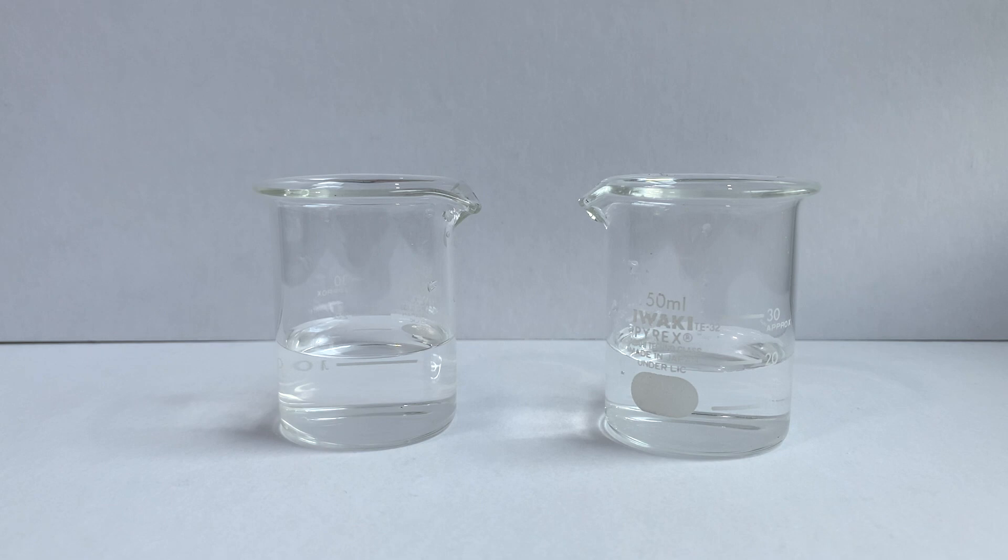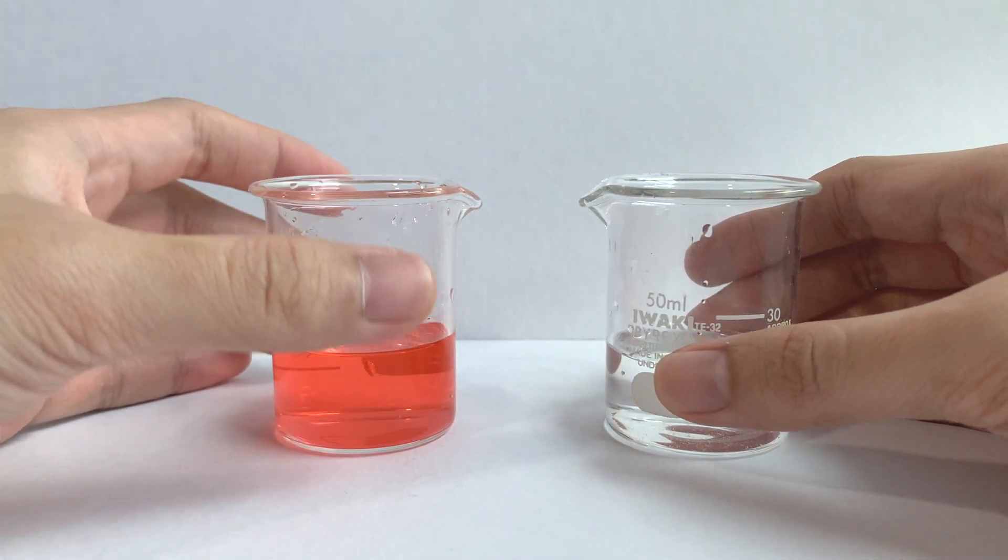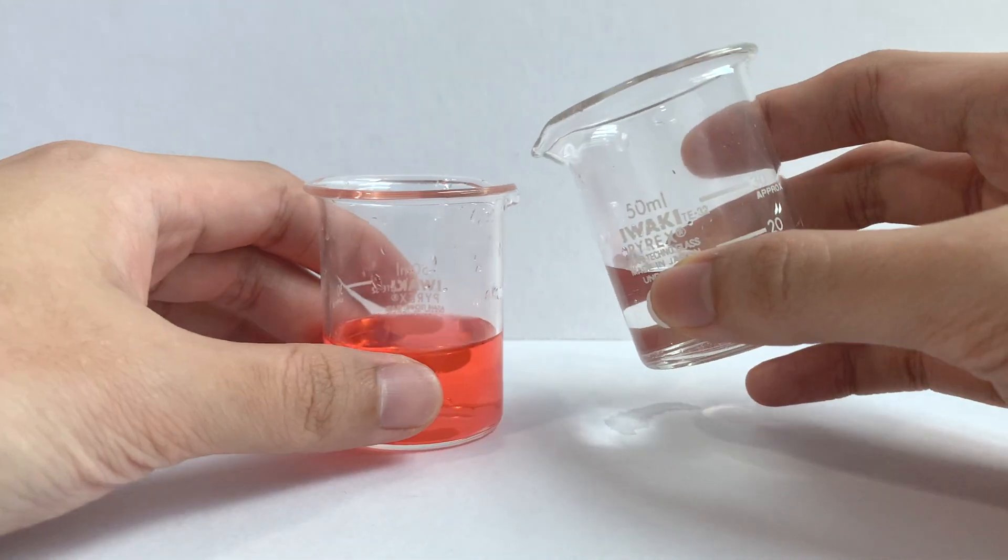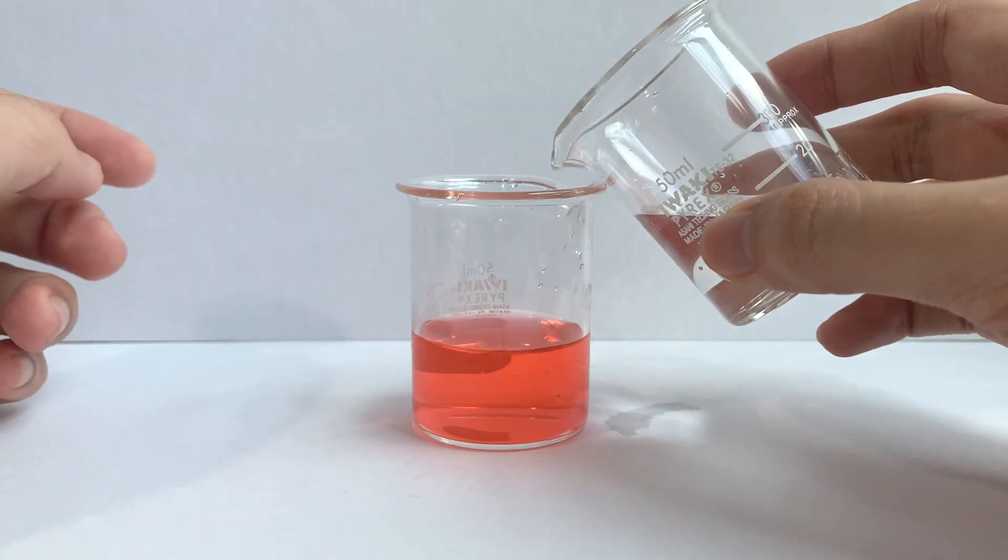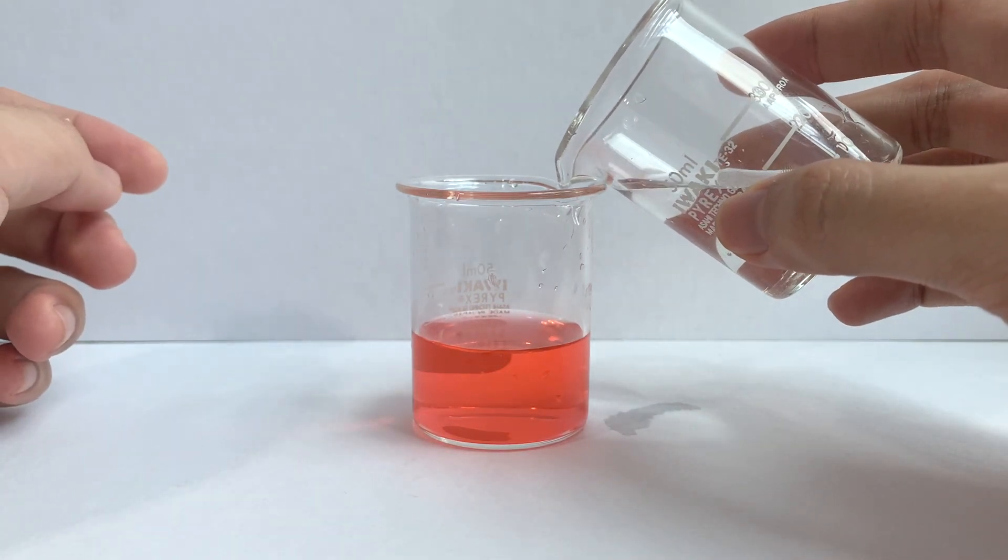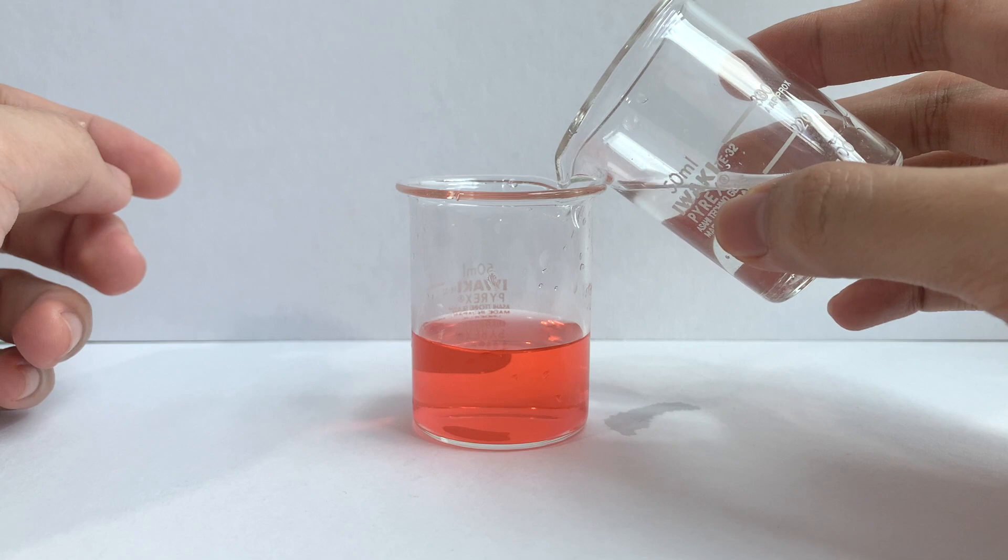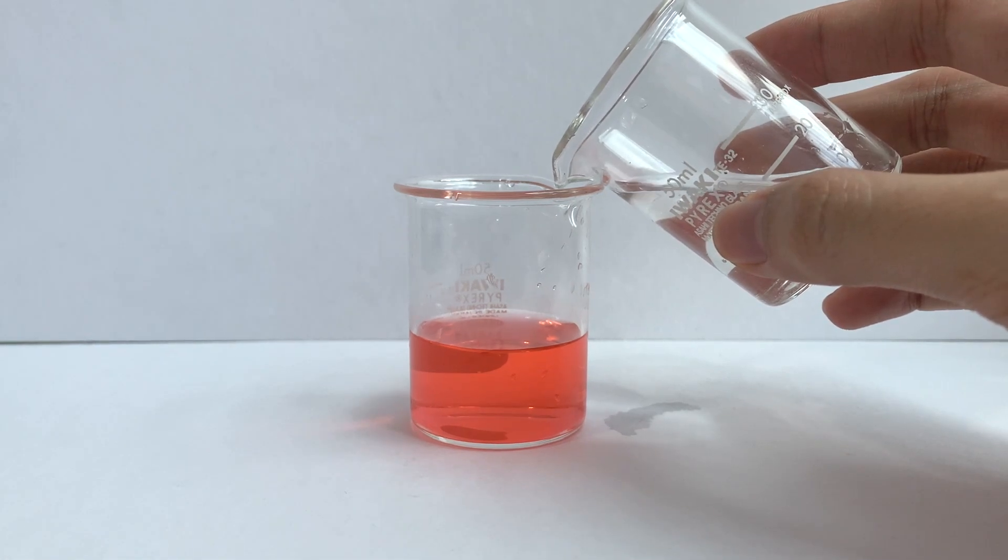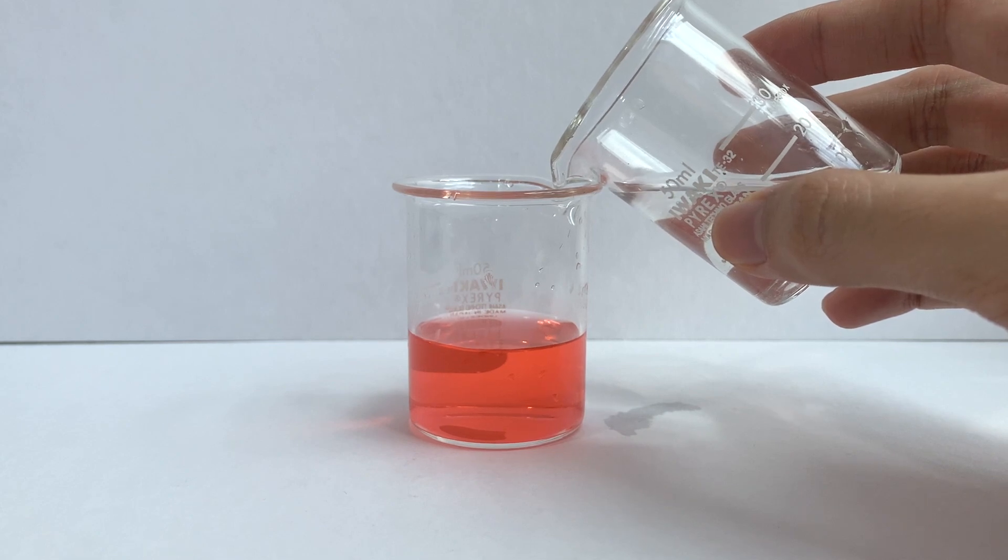Over here I'm going to add methyl orange to my acid. Methyl orange turns red when the pH is low such as in hydrochloric acid. So I'm going to add my sodium hydroxide in and stop when the indicator changes color. The color change that we expect to see will be from red to orange and then when there is an excess of alkali it will turn yellow.